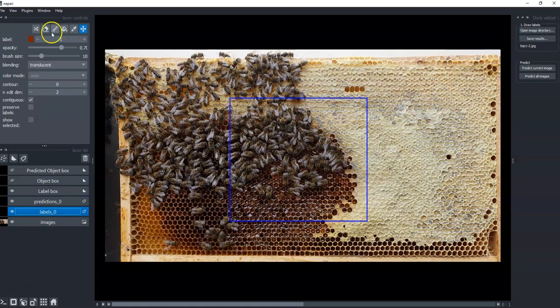There are a couple of differences when we're doing these sparse labels. This is really new. I don't know what the best protocol out there is, if there have been some recommendations yet, but playing with it, this is what I have found. First off, we used to not have to worry about the background and just label the objects. But now that we have sparse labeling, not everything is going to be labeled. So I found it works better if you actually label some background. So here I'm labeling background. I'm labeling it as 1, and I'm going to have to remember that because I'm going to have to manually make a little bit of adjustments. What the sparse labeling does is everything labeled as negative is just not included in the training calculations.